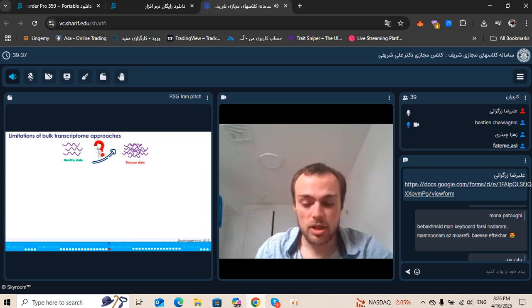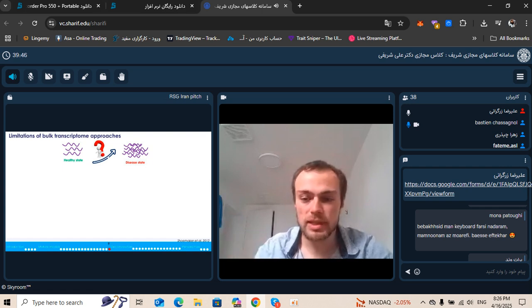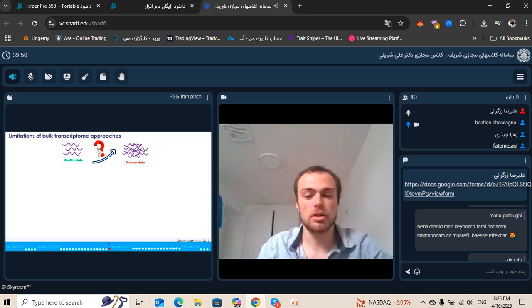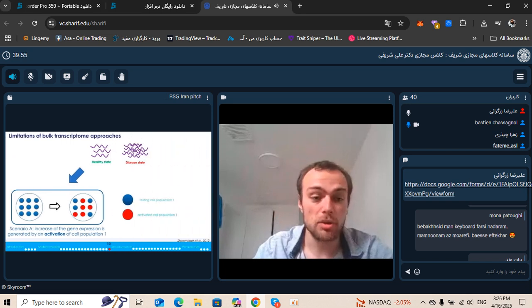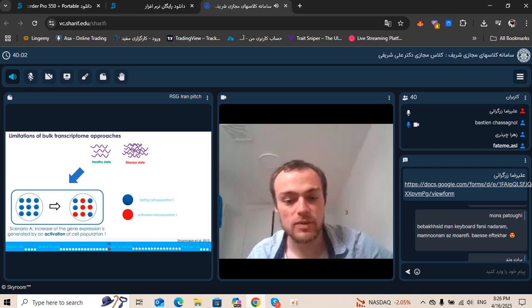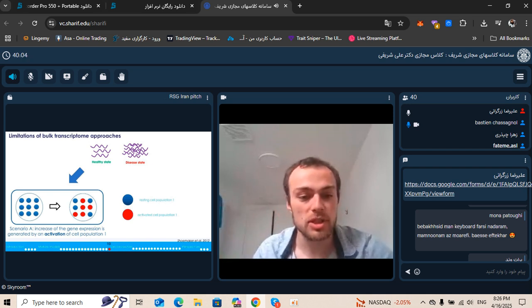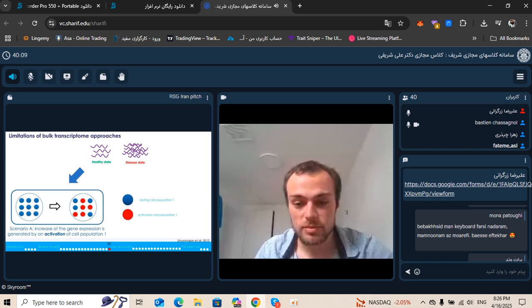So, of course, when you come up with these 4 clusters, what you want to do subsequently is to determine the most relevant biomarkers that can explain the change from one state to another. So this is the general overarching goal of differential analysis. And one of the premises when you observe a significant change of expression is that you have an induction of the gene expression within the cell population natively present in your sample.